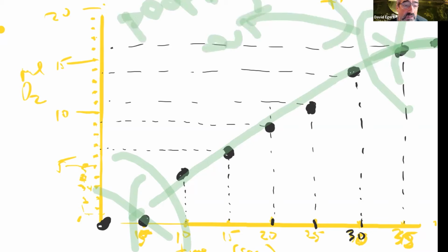So what we want to do is find this sweet spot, which is probably going to be in the first 30 or 40 seconds, where it's going pretty strong and pretty constant. You have to eyeball it. This is where drawing this manually and eyeballing it is how you do it. The computer doesn't have your sense of what is important or not important.